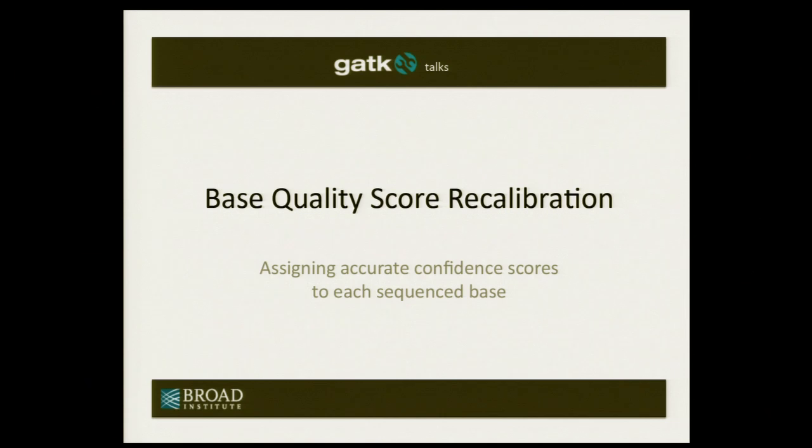Hi, so I'm Ryan Poplin, and for the next chunk of time, we get to talk about my favorite topic in the world, which is quality scores. In this little session, I'm going to try to convince you, first of all, that quality scores are incredibly important. They're the most important concept in next-generation sequencing.